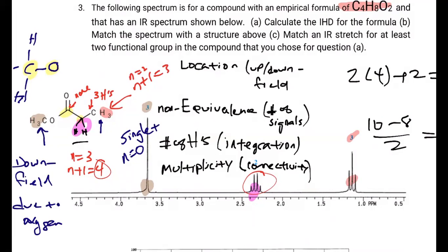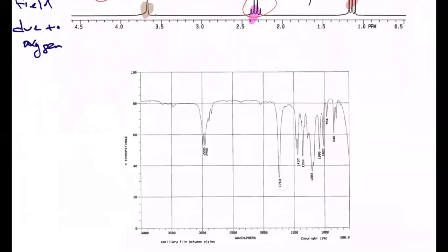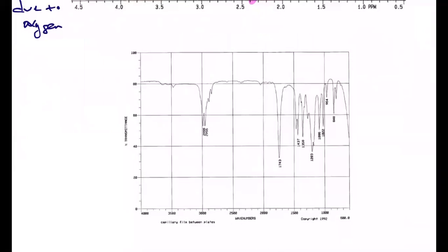All right, and then if you look in the infrared, which is underneath here, you can see the main stretch or signal that you see here is right there, and that's the carbonyl stretch again.